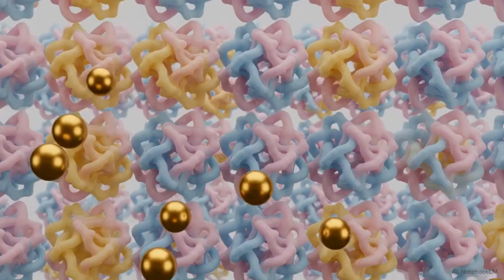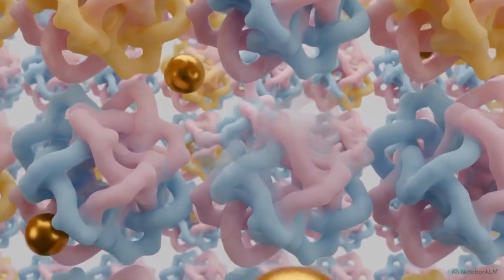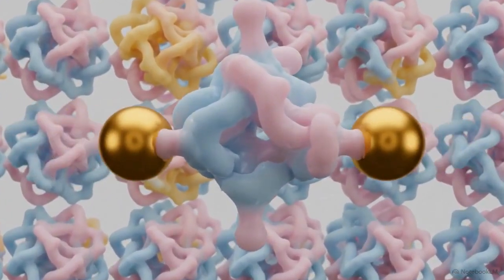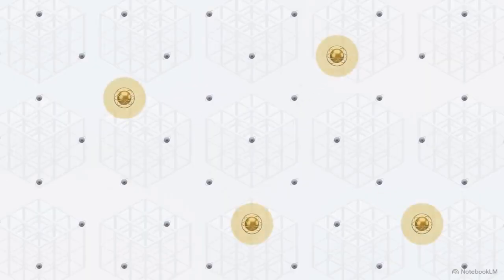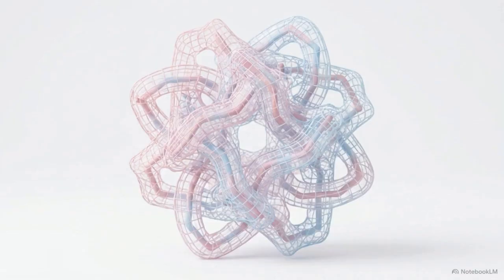By engineering heavy atoms like selenomethionine into the protein, they create dense, glowing marker points deep within the crystal lattice. These heavy atoms scatter X-rays differently, providing the reference points needed to calculate the missing phases. Once those phases are recovered, the math finally resolves into a clear three-dimensional map of the molecule. At this point, the Fourier transform takes the scattered data and reconstructs it into a 3D electron density map.